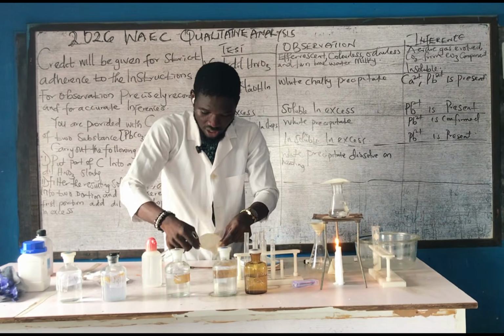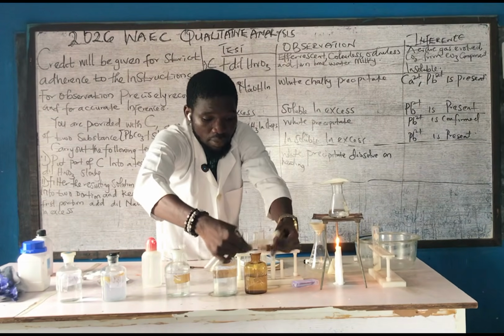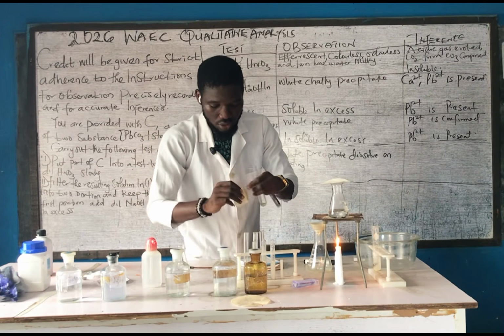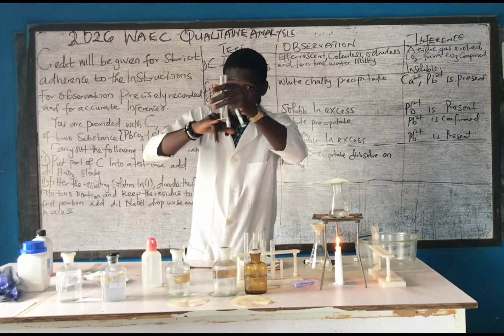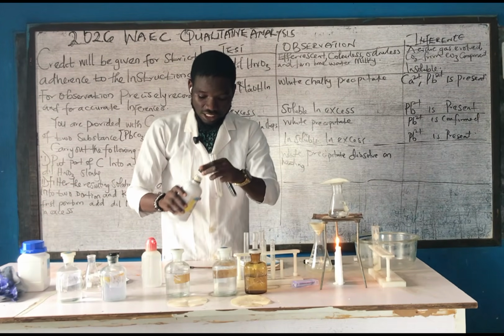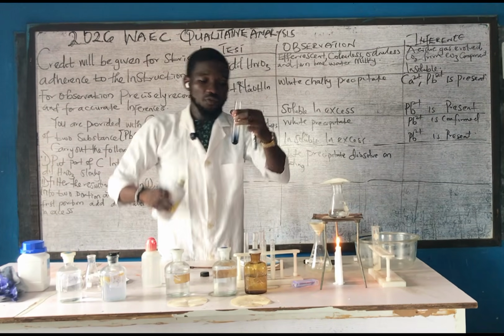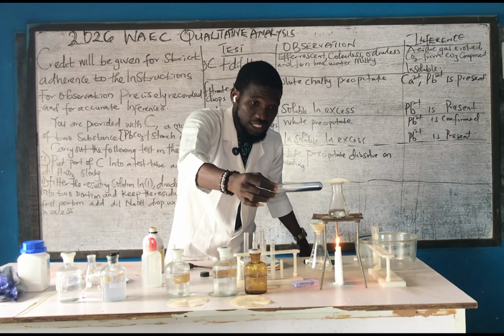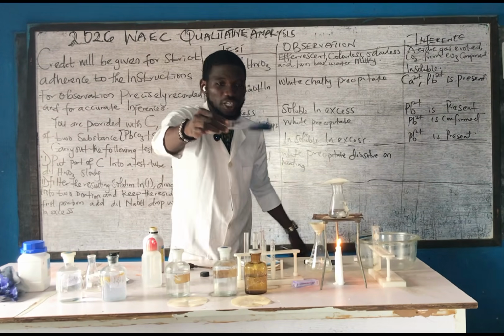Don't forget, I still have a leftover of my residue. There's a little residue here, so we are going to make use of it. Let me place it here so you can see. Be careful when you open. We have our residue here. So this is the filtrate. Now we have our iodine here. When you add the iodine to this, please be careful. If you observe, we are having a blue-black with filtrate plus iodine.